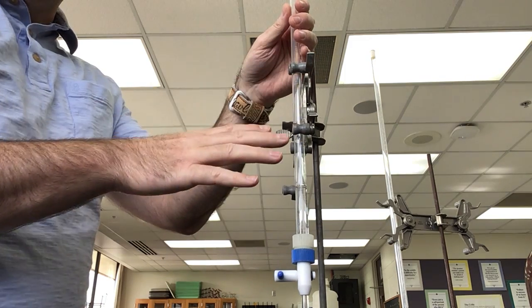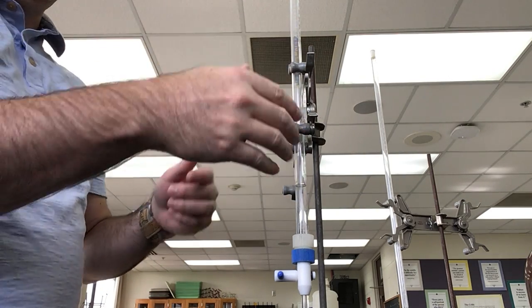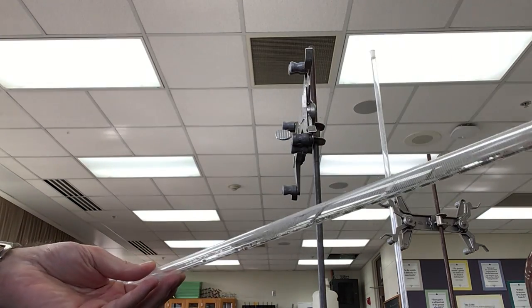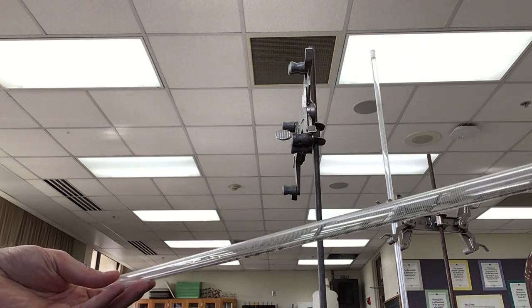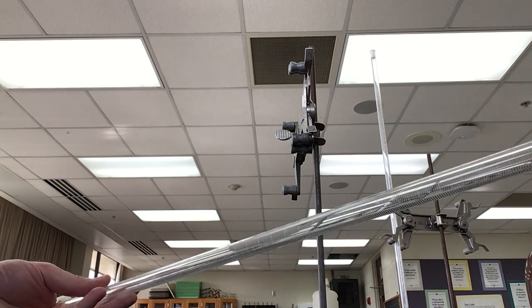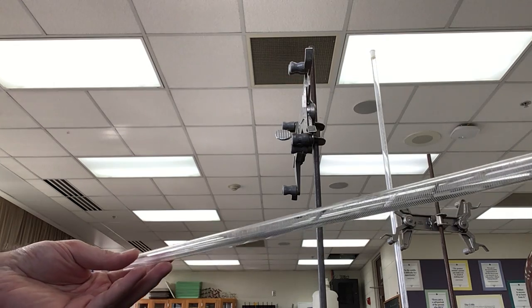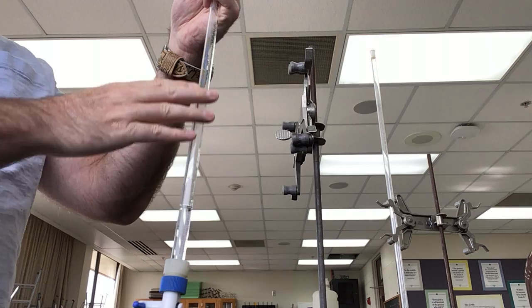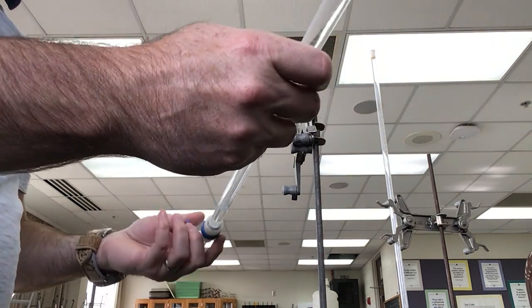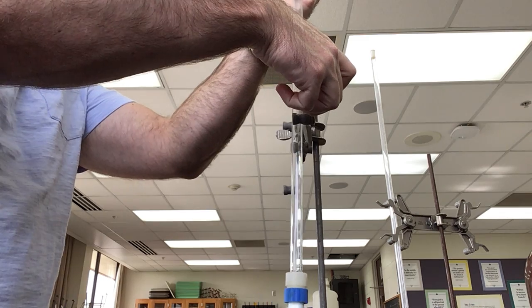And what I'm going to do is take this off of the Buret stand, and I'm going to try to kind of roll the Buret to get this liquid sort of coating on the inside of the Buret. So I'll kind of turn this on the side, and it's going to be hard to see here, but I'm going to try to move the liquid back and forth and kind of roll it along the way. If the titrant had a color to it, you'd see it a little bit more. And what this is doing is coating the inside of the Buret, and so anything that was in here previously, the solution is mixing with. And then we're going to dump this out, and we'll repeat the process a couple times. So I'll go ahead and dump that out. And again, we'll repeat this maybe a couple more times.